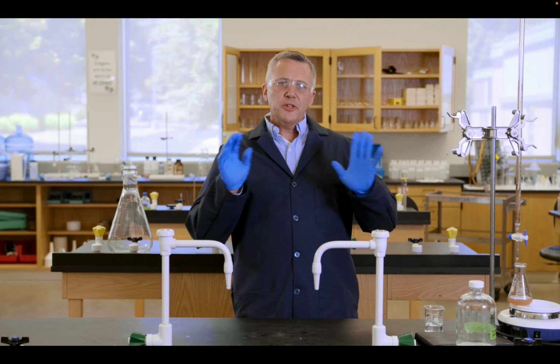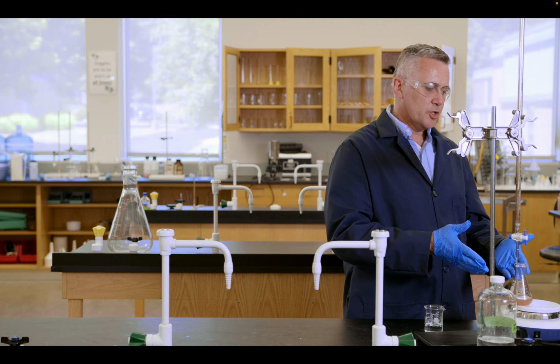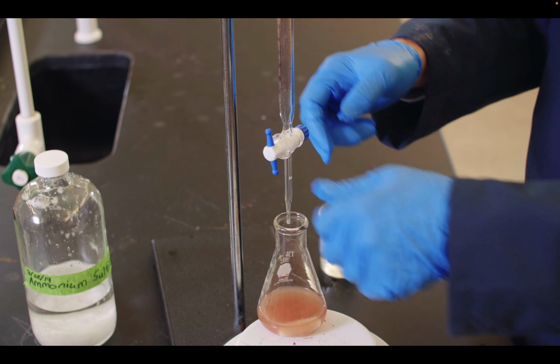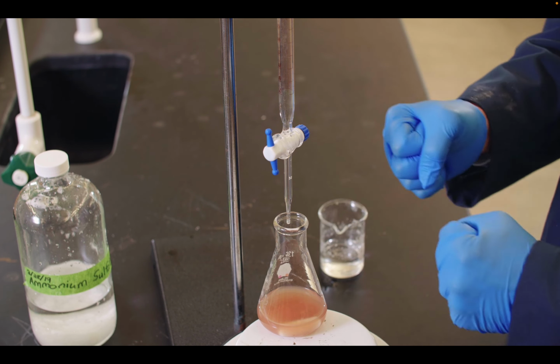All right, so this is a fractionation step. That is, we're fractionating proteins at various points, and so we're making GOT a little bit more pure at this stage. So based on our calculations, we need 52.8 milliliters of the ammonium sulfate to be added to our 35.2 milliliters of fraction 2. All right, so before we're adding in small amounts, a good thing to do in this case is actually use a burette, where we can add ammonium sulfate, 52.8. So when we use up to 50, we have to add a full amount and add a little bit more. We can open the stopcock, we can stir it, and if we do this at a really slow rate, then we can add enough of the ammonium sulfate to precipitate out the proteins and get to that 60%.